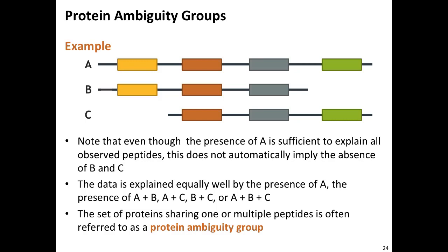One of the things you could look at is quantitative data. Yeah, if you have not just 1 sample, but if you have 20 samples, and if the concentrations of these 3 proteins change in a meaningful manner, then you can look at the ratios of those guys. Why is that interesting?